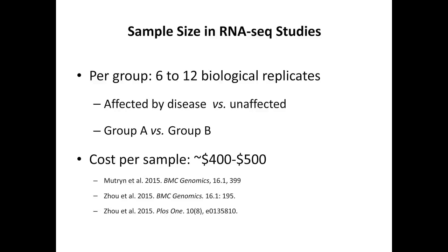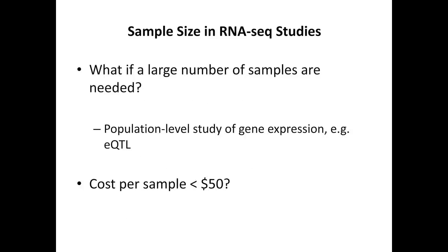We have done several RNA-seq studies in the past. These are some examples of recent publications that my lab conducted. The major driving force for us is how we can reduce the cost of RNA sequencing.